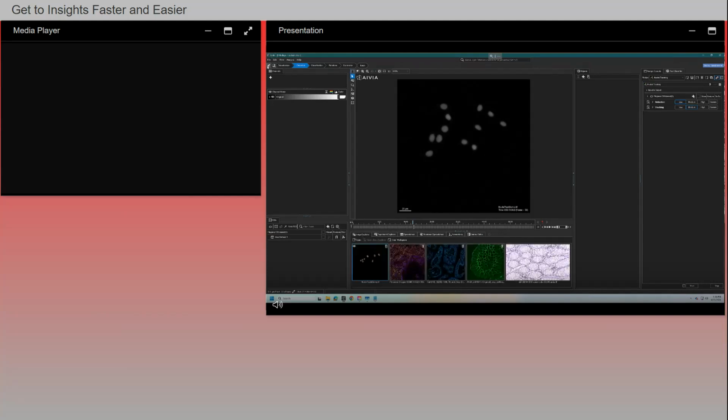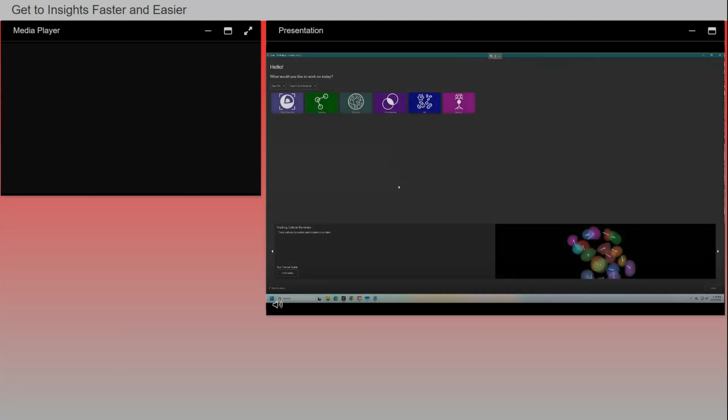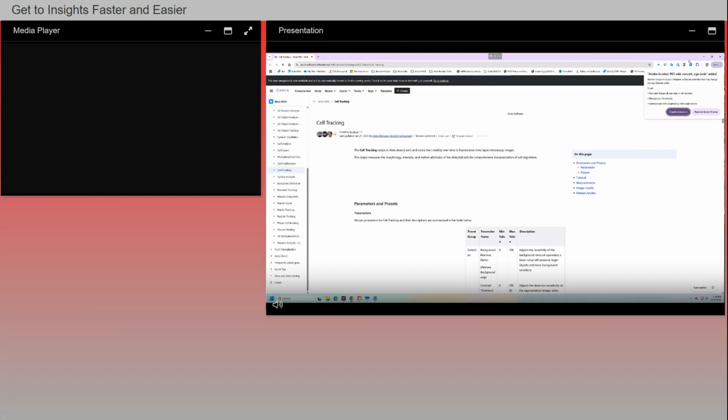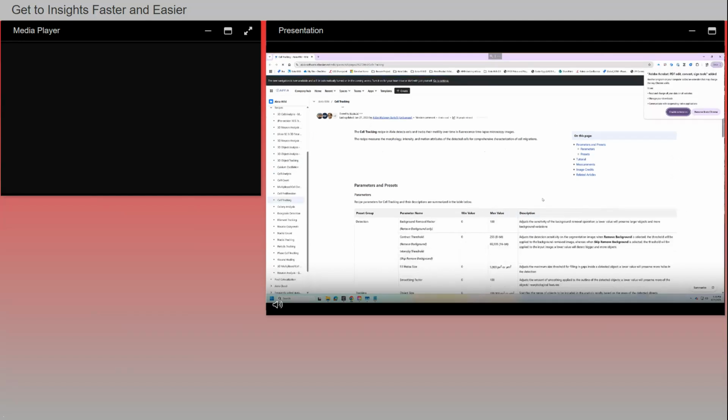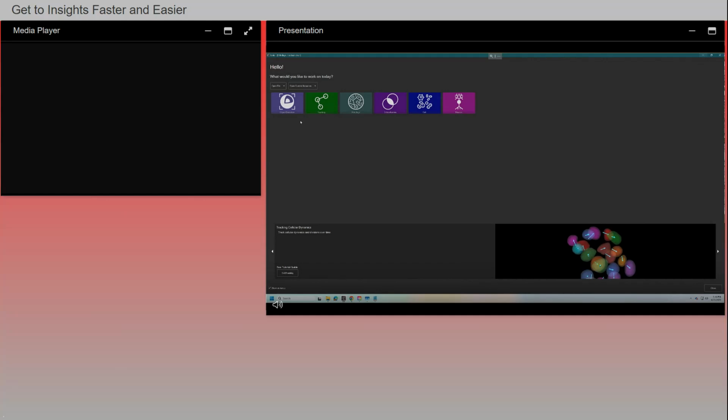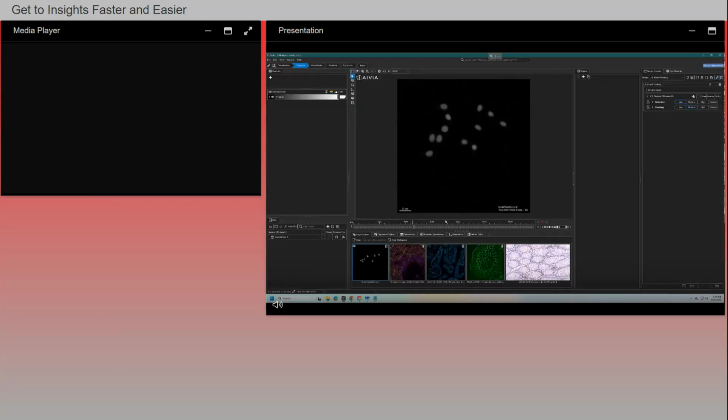At any point, if a user would like to get back to the launchpad, there's this nice rocket icon that gets you back. In addition, you can get a tutorial on how to perform your endpoint by clicking on any of the tutorial links, which goes into great detail about what each parameter means and how to optimally use them. At any point, a user can choose to close this and permanently turn this off if you no longer see a need for this suggestion.